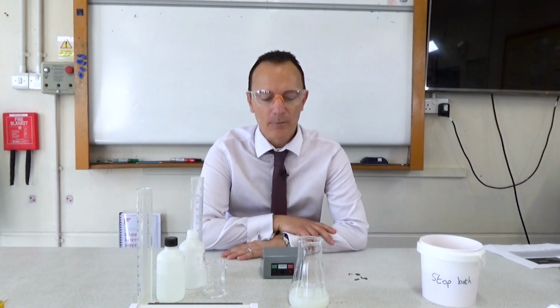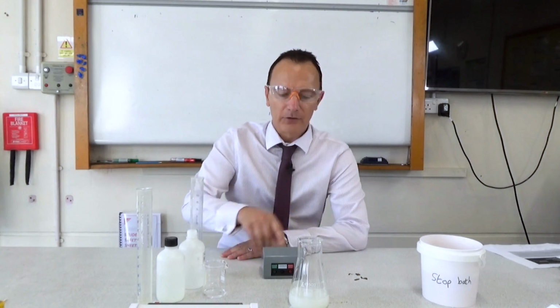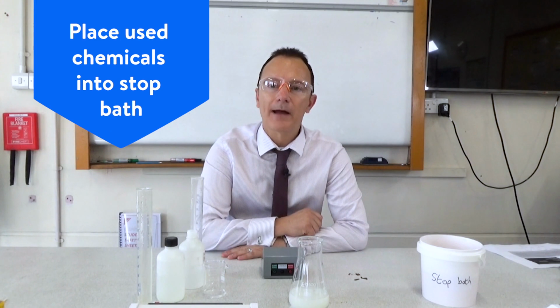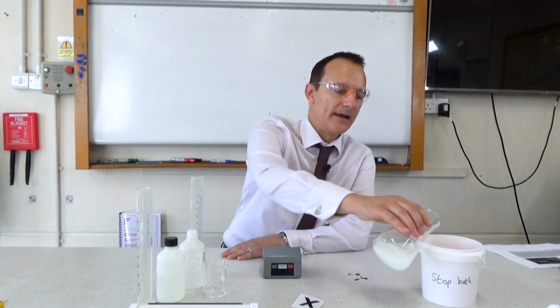We've just got to the point where I can no longer see the cross on the white paper, so I'm going to stop the stopwatch, and now I must remember to tip out the chemicals into the stop bath so that we stop any more of that sulfur dioxide getting into the air.